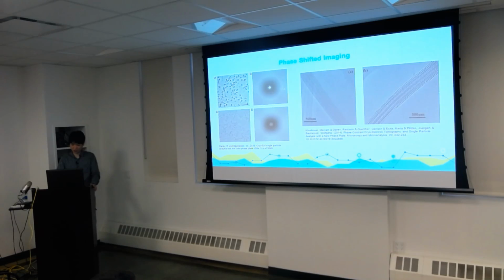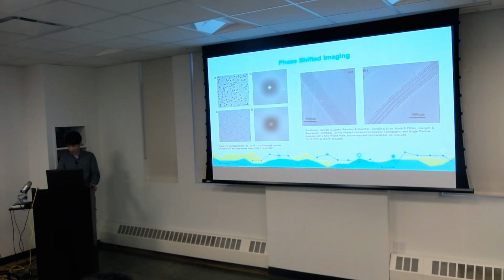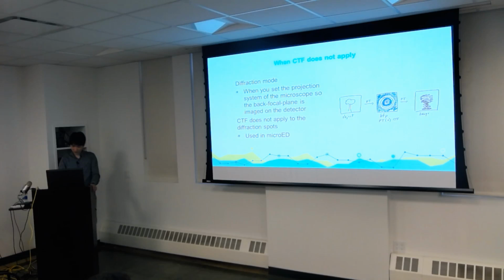And this can help you in a lot of things, from single particle imaging here. Sorry, so we're actually looking at tomograms, because you can see the details. These are tomograms, so they are similar tomograms, except in this one you can actually see more finer details of the part of the cell. You can see all these things as compared to this one, thanks to the phase plate. Okay, any questions?